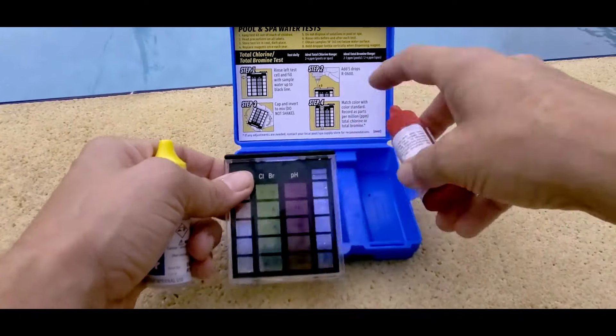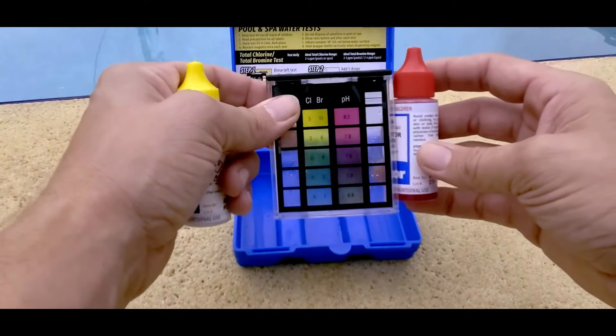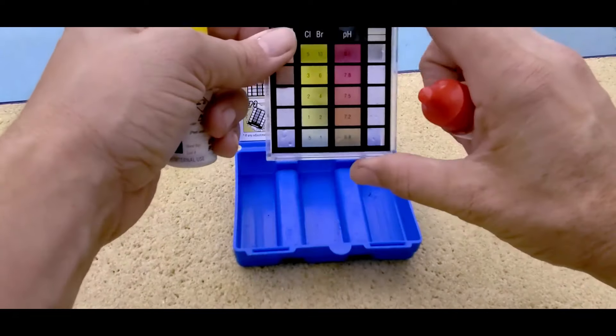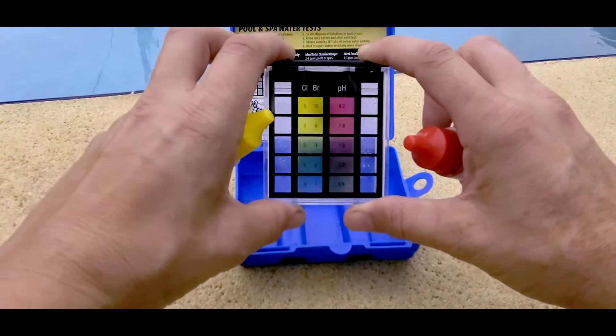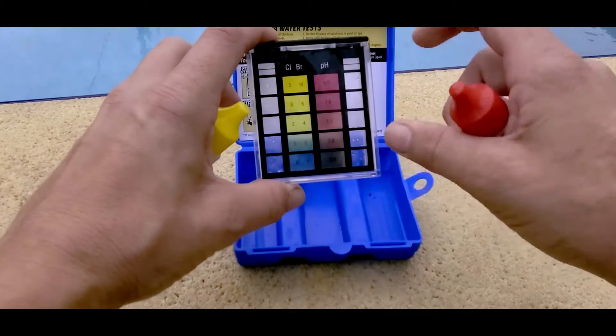And then you add five drops to the pH side of this solution. And then you can match up the colors and see which level your chlorine is at.